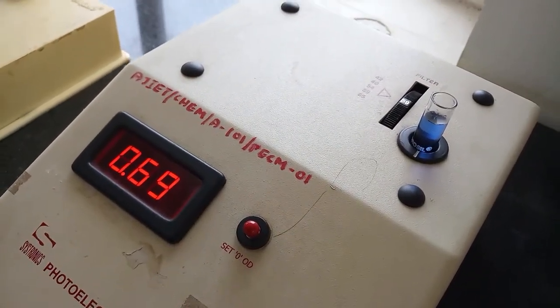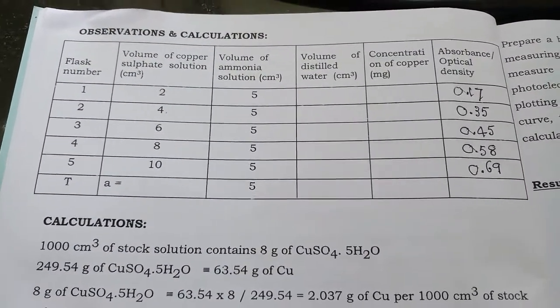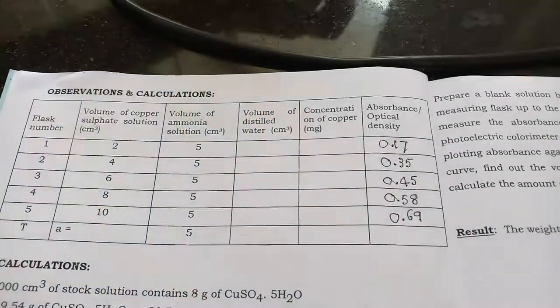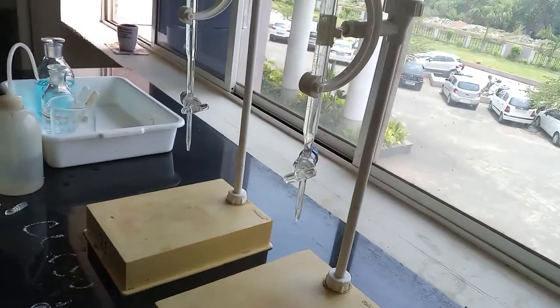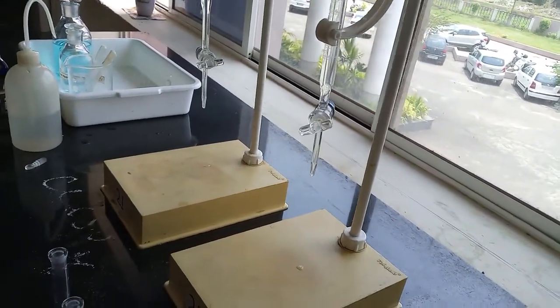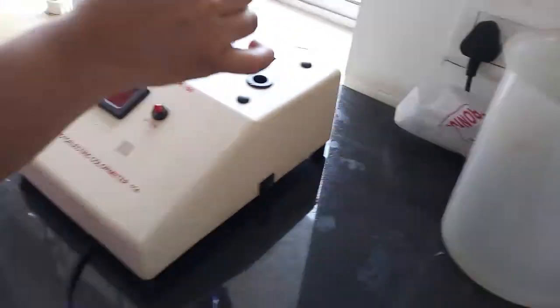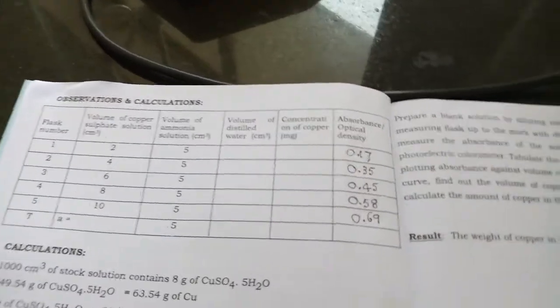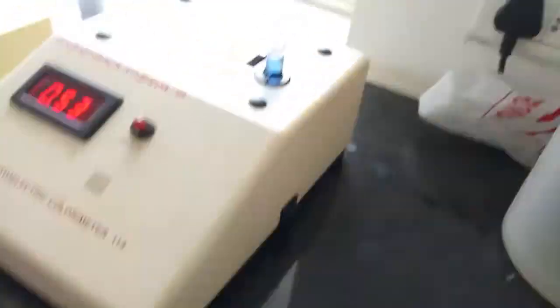Here we have 10 ml of copper sulfate solution, and the absorbance is 0.69 — that is also recorded. So the readings are: 2 ml → 0.17, 4 ml → 0.35, 6 ml (recorded), 8 ml → 0.58, and 10 ml → 0.69. These 2, 4, 6, 8, and 10 ml values serve as the reference volumes.